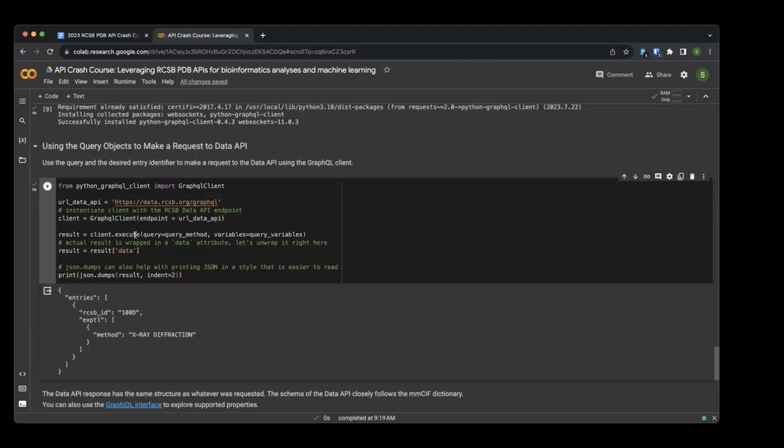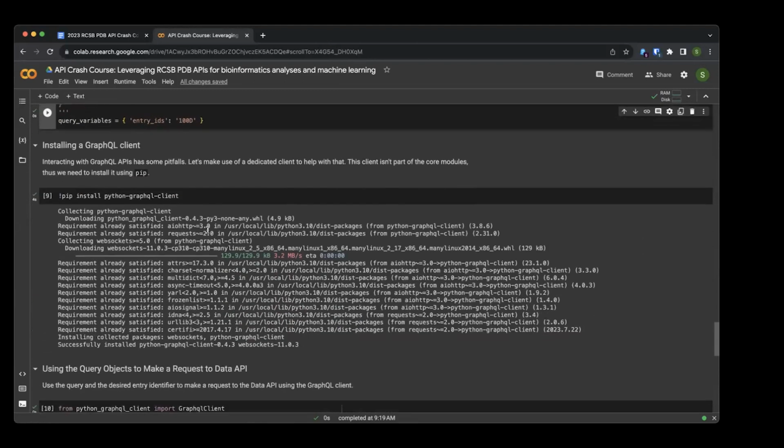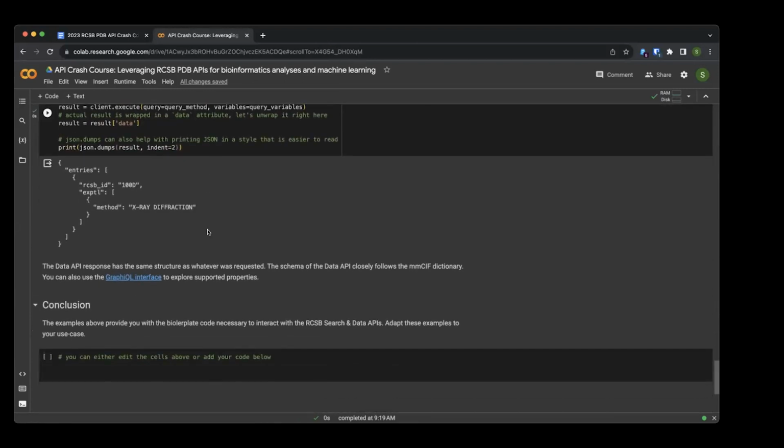And one thing I didn't point out, you can easily make changes to those individual cells. So you could, for example, pull more information for one particular entry, or you could change the Search API query to look for something more elaborate that is more closely related to the use case that you actually want to address. So yeah, let's continue at 22 and let us know if you have any questions that came up at this point. So just basically make sure that you can execute code.